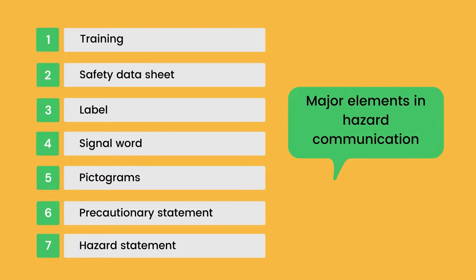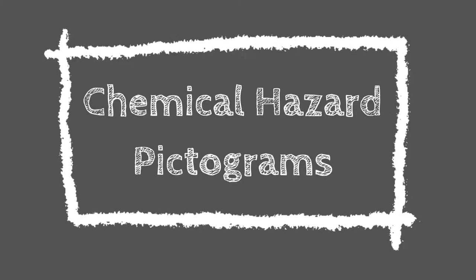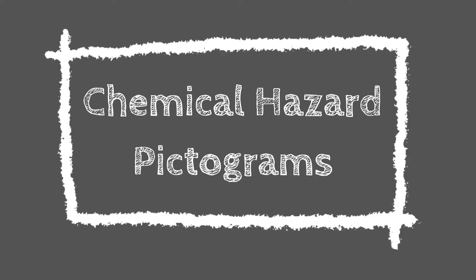Major elements in hazard communication include: 1. Training. 2. Safety data sheet. 3. Label. 4. Signal word. 5. Pictograms. 6. Precautionary statement. 7. Hazard statement. Hazard pictograms alert us to the presence of a hazardous chemical.